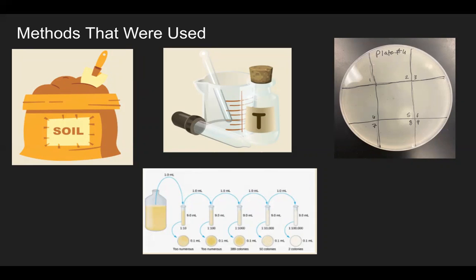We use several methods to isolate and characterize these phage samples, such as filtration and spot testing, serial dilutions, restriction enzyme digestions, electrophoresis of genomic DNA, and staining phage particles for transmission electron microscopy.